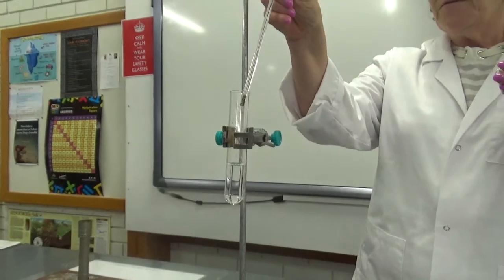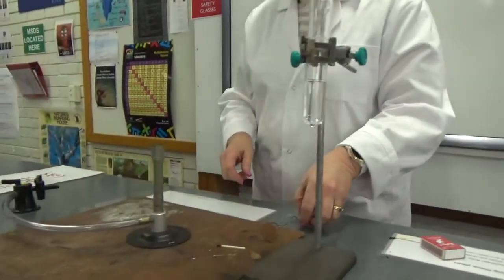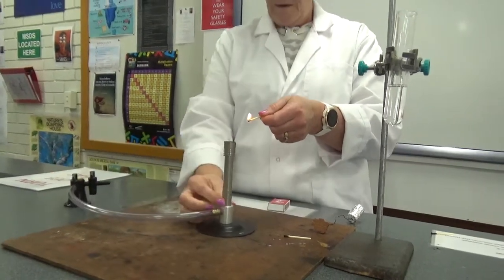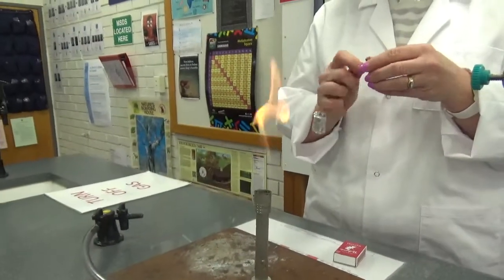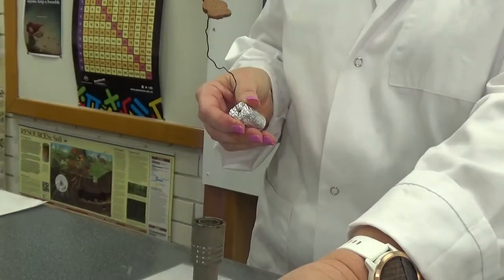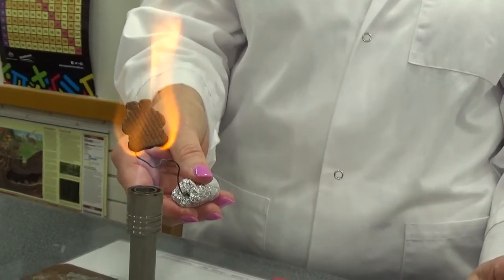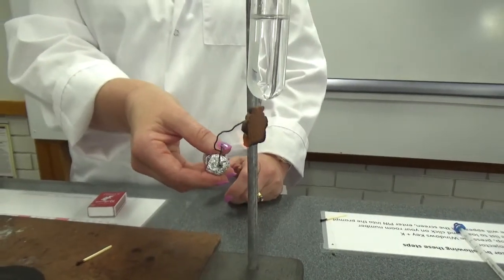So, Ted, prepare to die. Bunsen burner on — safety flame, then hot flame. Let's burn this bear. He's on fire! Now he's really on fire — let's get him under there. He's not burning enough, he goes out. We're going to have to light him up again. We're just going to hold him under the test tube.